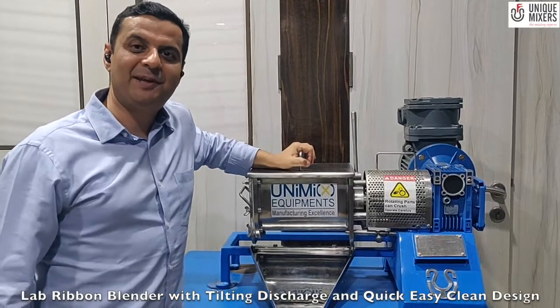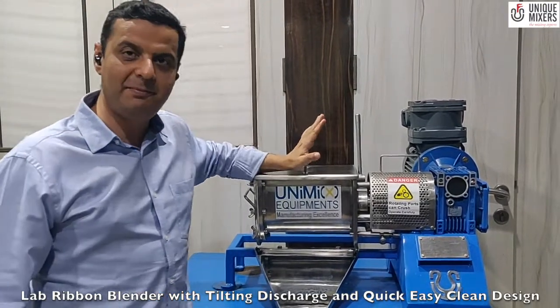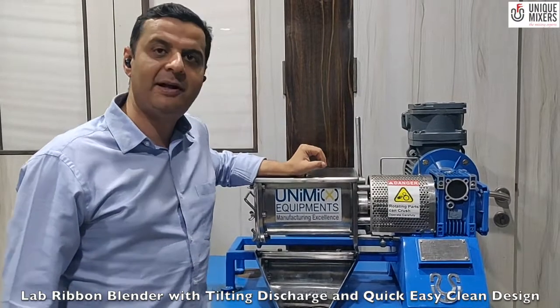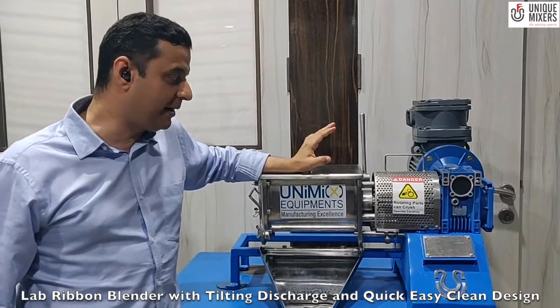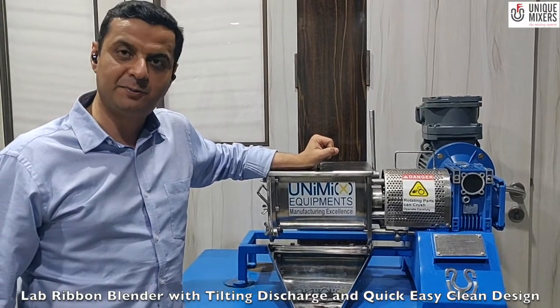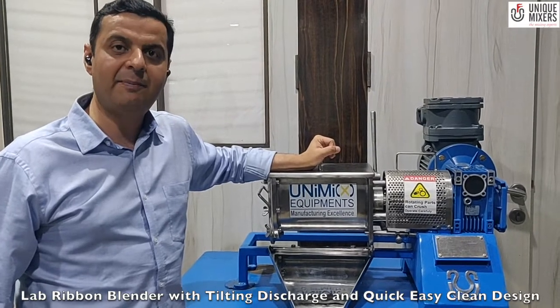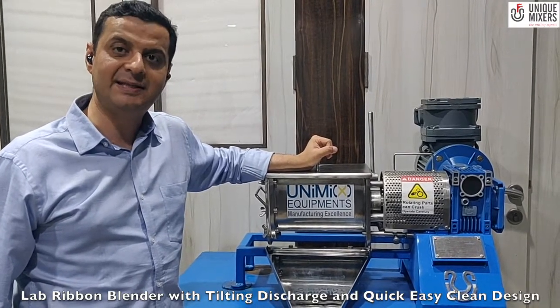Hello and welcome to Unique Mixers, The Mixing Experts. Today we have to showcase our laboratory ribbon blender. This ribbon blender has a 5 litre working capacity and is powered by a 2 horsepower motor and a worm gearbox for speed reduction. The gross volume of this blender is 8 litres and the contact parts are in stainless steel 316L.